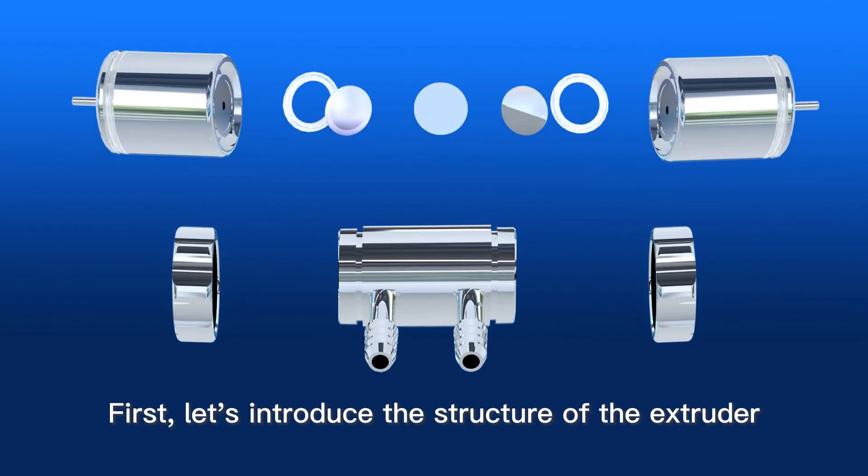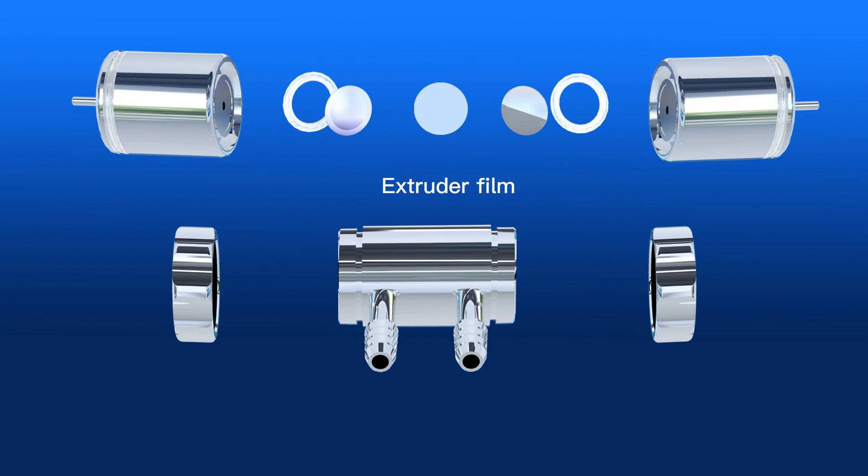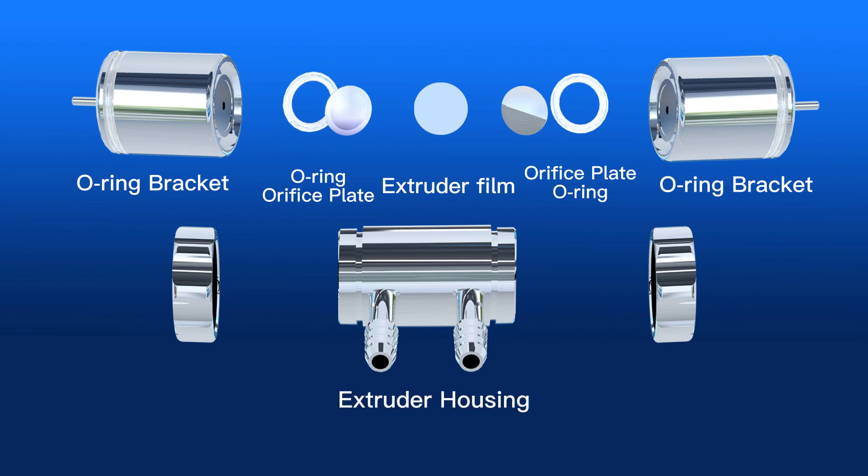First, let's introduce the structure of the extruder. Extruder film, orifice plate, O-ring, O-ring bracket, extruder housing, container nut.